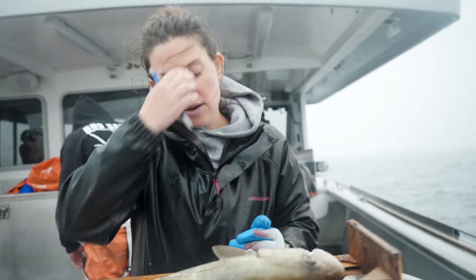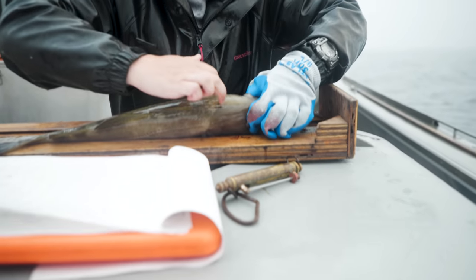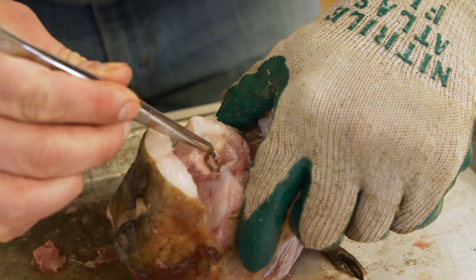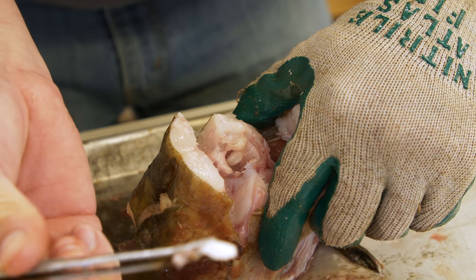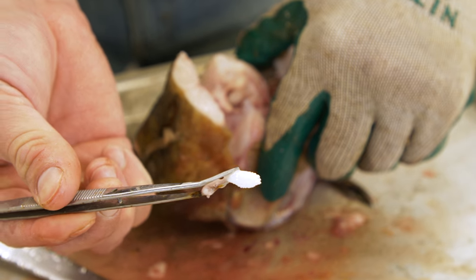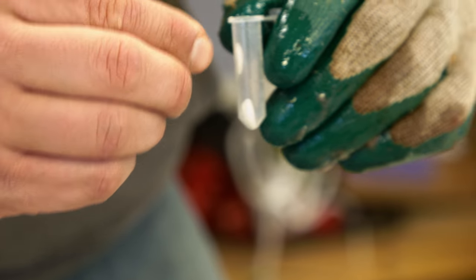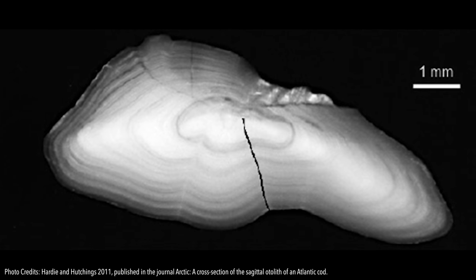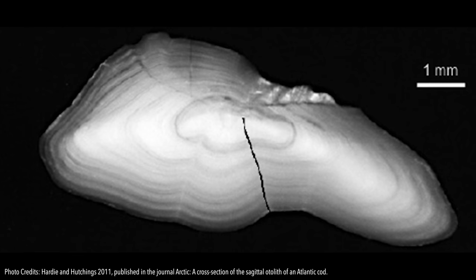Two other samples that we take are otoliths, which are ear bones within essentially the fish's head — they're gonna come out of right here. I'm going to cut off the whole head and then later, once the survey is over and we're in a lab on land, we'll extract those. The really interesting thing about otoliths is that we can figure out how old a fish is by looking at them. If you cut them, they have rings kind of like a tree, and you can count the rings to see how old they are.